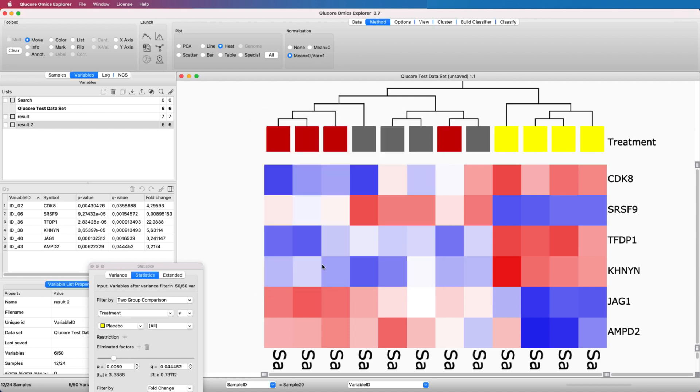When a list of discriminating variables is identified, it can be a good idea to study the individual variables in detail. One option is the box plot.